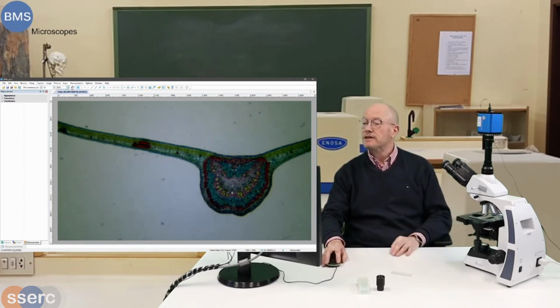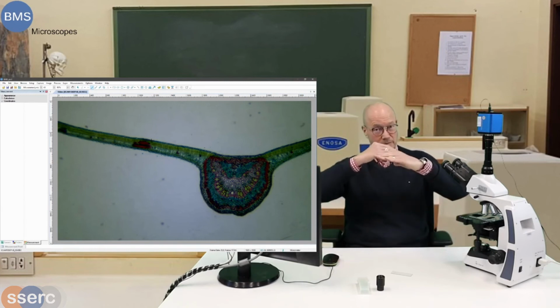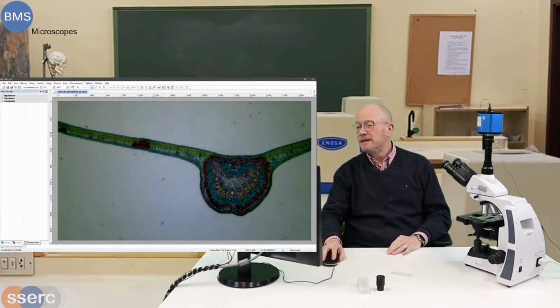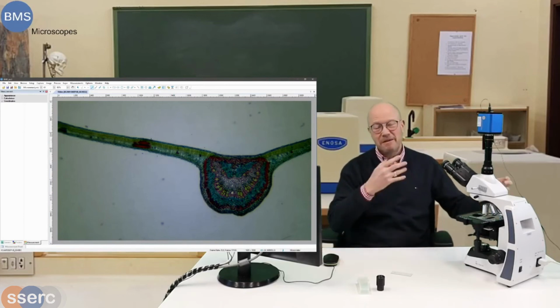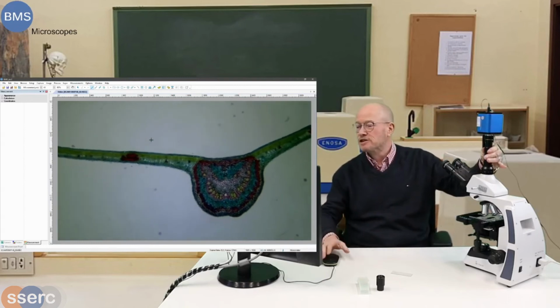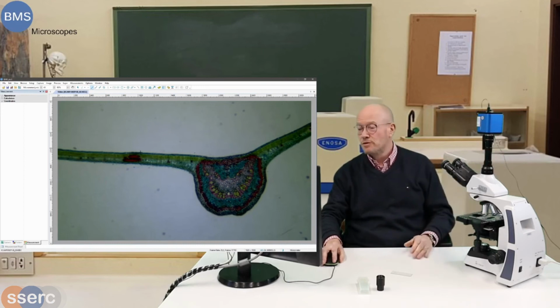And if I start doing a line measurement, for instance, I can go from here to here. But you see there is this little cross, and it has a nice horizontal bar and a vertical bar. And to make the measurement as good as possible, I prefer, but that's my own preference, to have it leveled as well as possible on a horizontal level. Here was approximately the line that we used to measure.